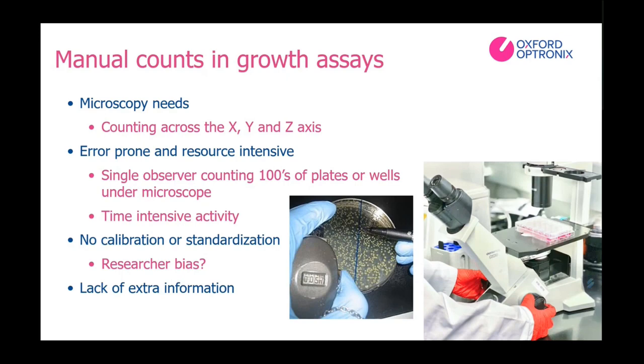Okay, so let's compare these counting methods just a little bit here. So first, for manual counting of organoids, it can most often be summed up like this. A well-trained researcher under a bright field microscope finds an object and then determines if it's an organoid or not. If it is established to be an organoid, the researcher then needs to ascertain if that organoid meets the minimum size requirements. Again, if it does, then one is added to the running total and the researcher moves to the next object. Now, this next move, though, needs to be extremely systematic so as not to risk recounting previously counted organoids, and the process is repeated for every object across every well and plate.